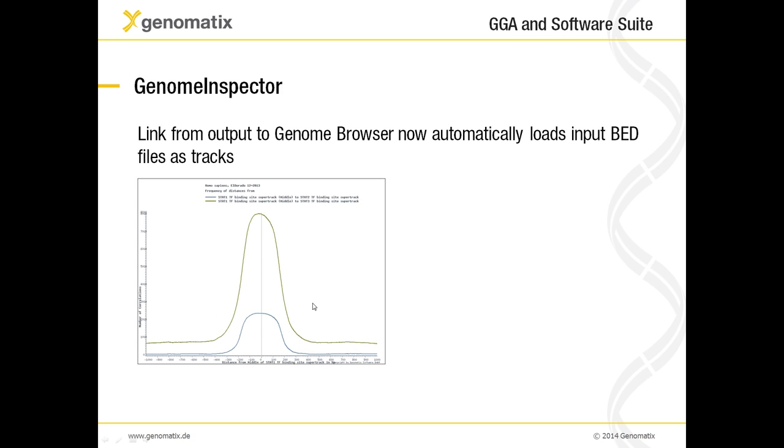And you see such an example here. You might already be familiar with that. Here we have an example where we have the data from ENCODE where we have STAT1 transcription factor binding as the anchor and STAT2 and STAT3 transcription factor binding as the 2 partners. And we see a peak from the partner sets around here.